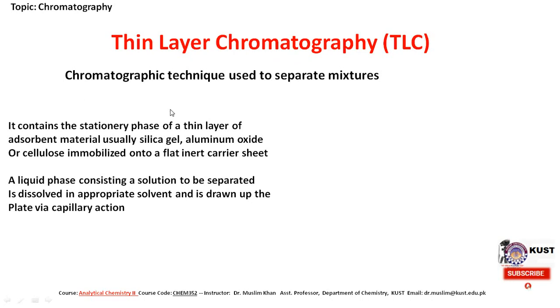Nowadays people are using high performance liquid chromatography. This thin layer chromatography was initially used for the identification of compounds in a mixture.